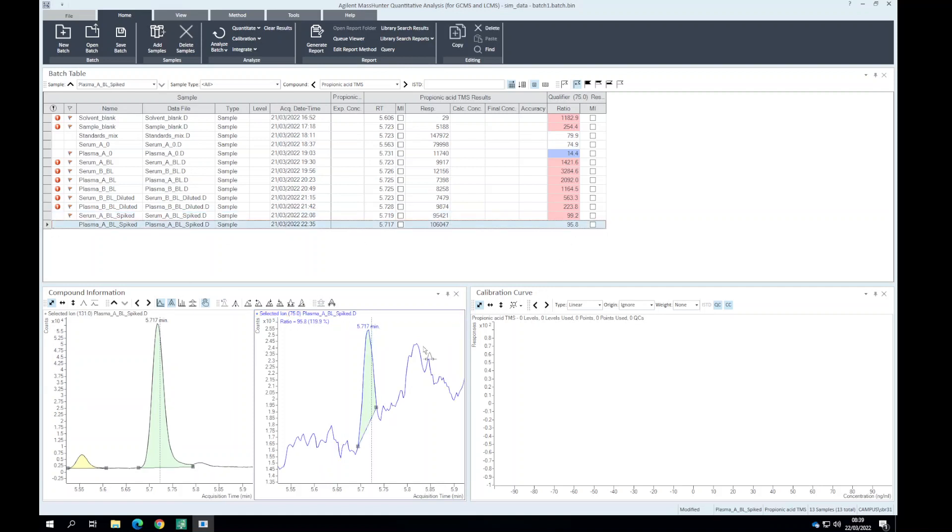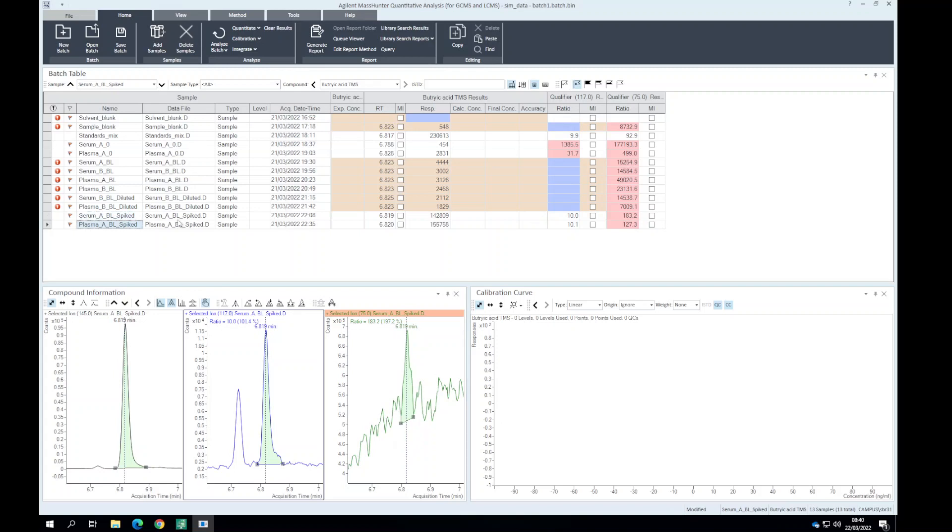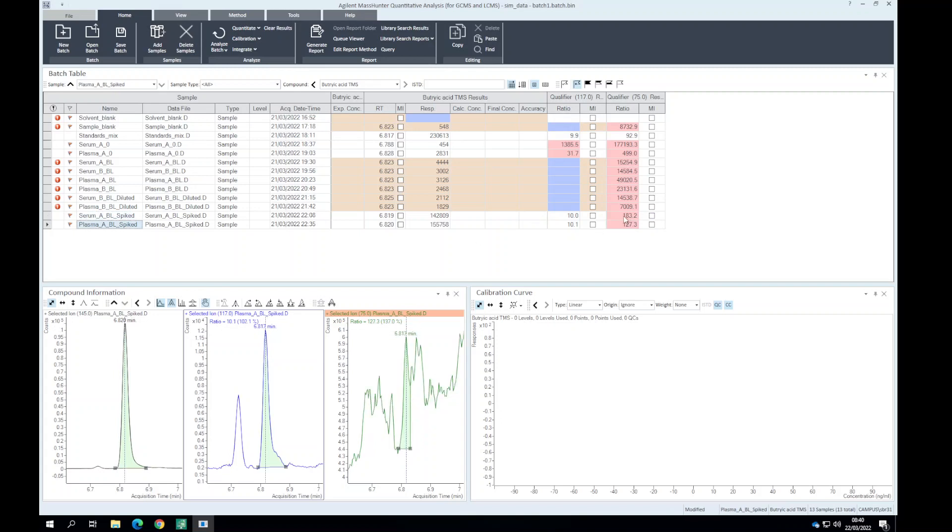In this case we can see the qualifier ion in our second plasma spike. Potentially there's a difference between the cleanup in plasma and serum. The third analyte to be spiked in is butyric acid. Here we can also see slight deviation in the 75 qualifier ion. It looks like there's a lot of background, so potentially this is a better gauge to go by, that 117 qualifier ion.